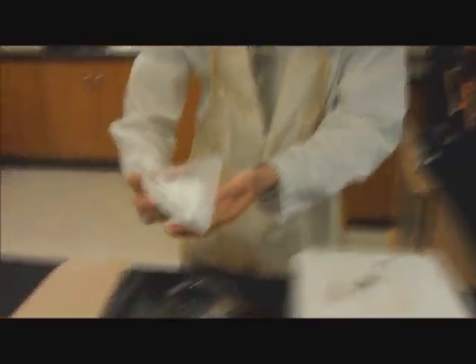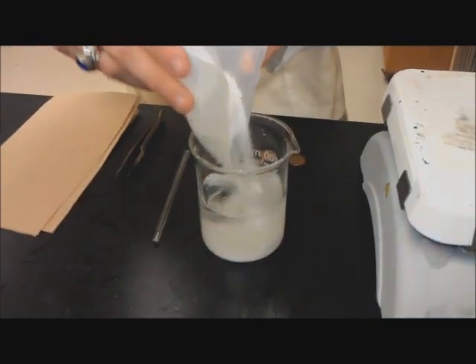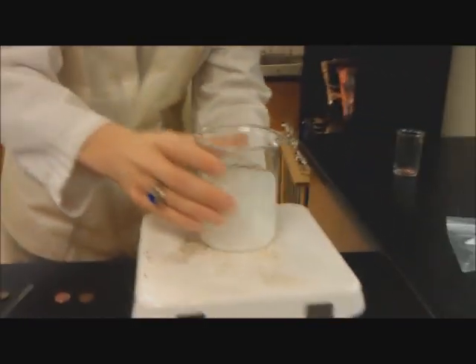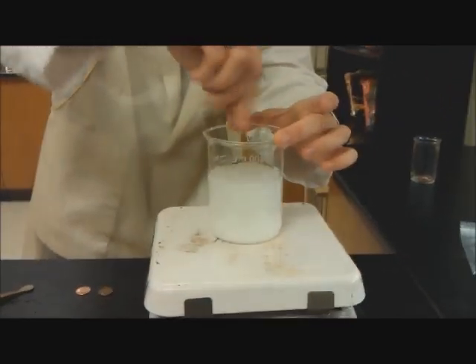The first thing we're going to do is we have some zinc sulfate. We're going to take that — that's about 60 grams — we're going to dissolve it in water, about 200 milliliters of water. Put that all in there, then we're going to put that on the heat source and heat it up while stirring it.